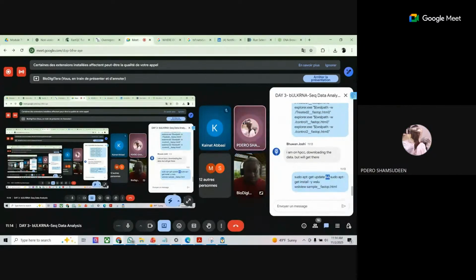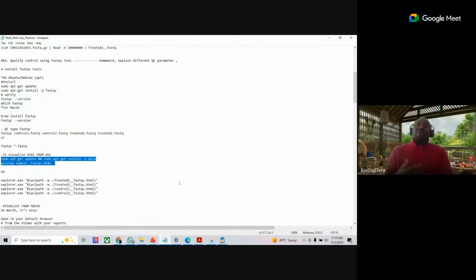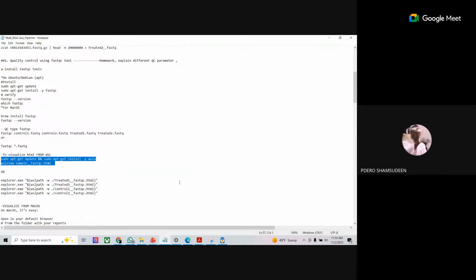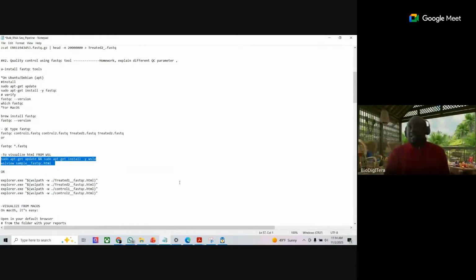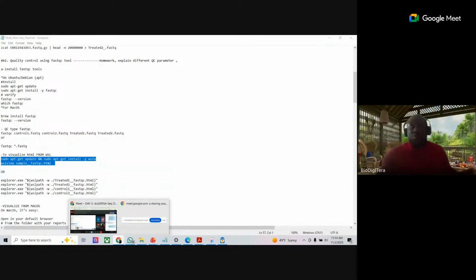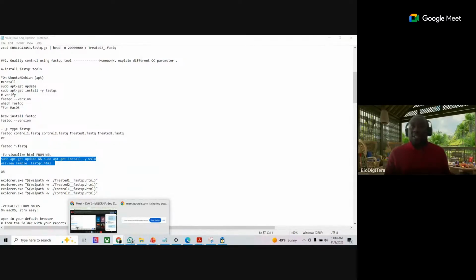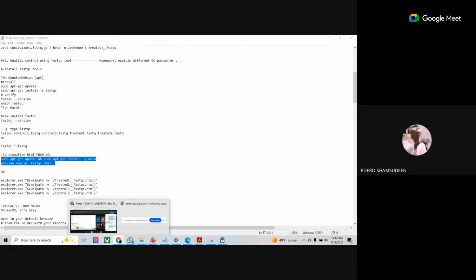Sorry, sir. I'm just joining again, sir. What are we using this command for? Did you run the fastqc on your sample? Yes, I did. When you run, are you able to visualize? You are seeing HTML. I've not visualized. Okay, yes, you have to visualize. Because when you run, you have to open now the fastqc report, the file ending with HTML. How will you open it to see if your data are of good quality or not? That is the question. How do I open, sir?